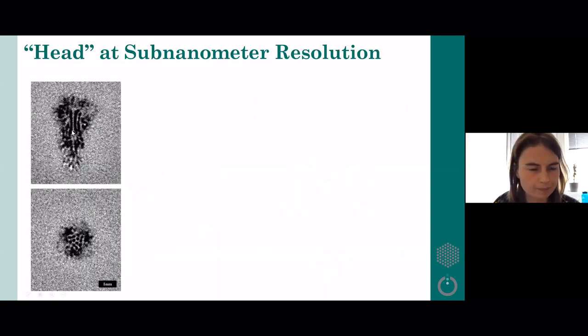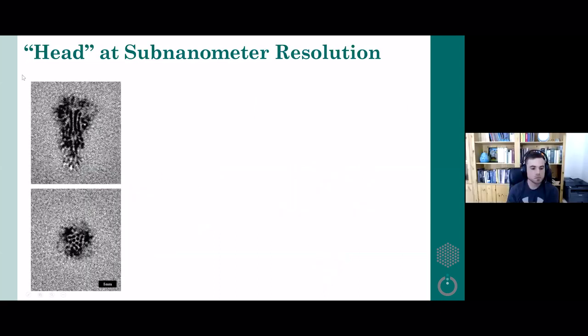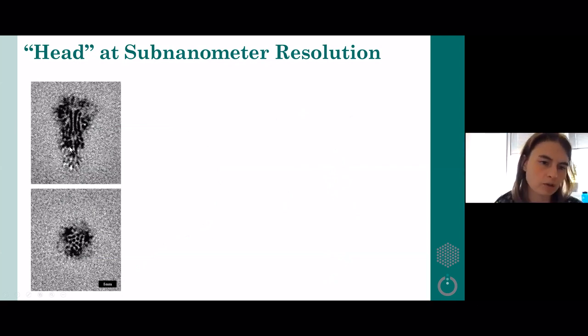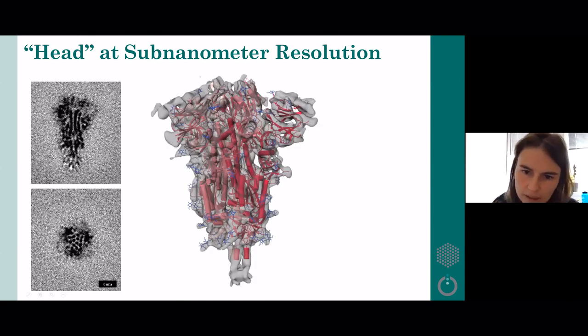So if we go for a map of the globular domain, this is the electron density map. We succeeded and obtained structure at sub-nanometer resolution around eight angstroms. You can see the alpha helices that are there. This is the side view and from top view you can see how nice they are. If you use isosurface modeling to look at this in a more 3D way, we have nice details. We have the helices inside, the structures, and the models that were known from other studies actually fit.